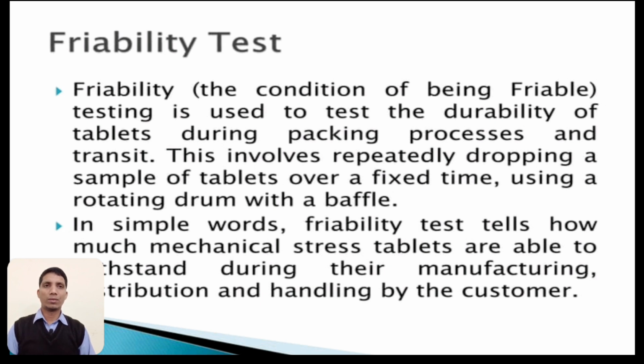In simple words, the friability test tells us how much mechanical strength the tablets have and how well they are able to tolerate manufacturing, distribution, packaging, and transportation until they are handed over to the patient as the final product.